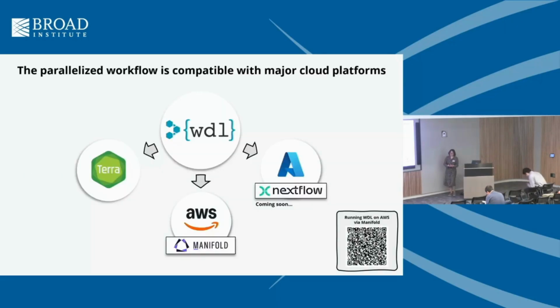Yeah, so as Cameron mentioned, we have this workflow available on GitHub. We'll share the GitHub repo with the QR code at the end. Currently, the workflow is written in the WDL language, which allows you to immediately deploy the workflow to a number of cloud platforms, such as AWS through Manifold. We are also working on porting this workflow to Nextflow so you can use it with, for example, Microsoft Azure.